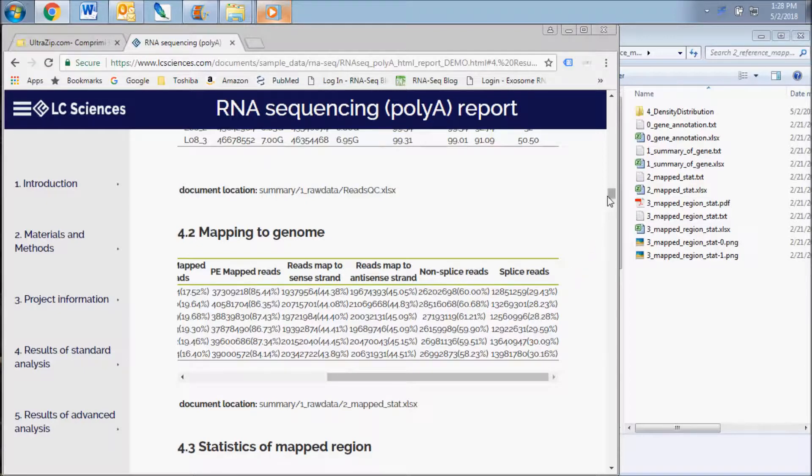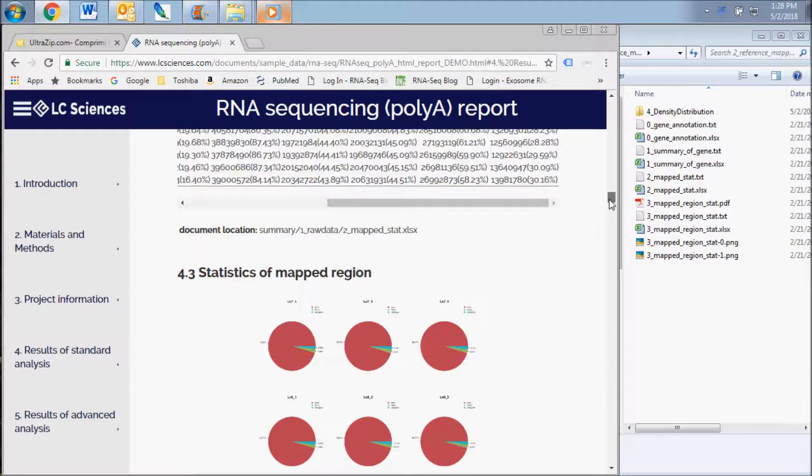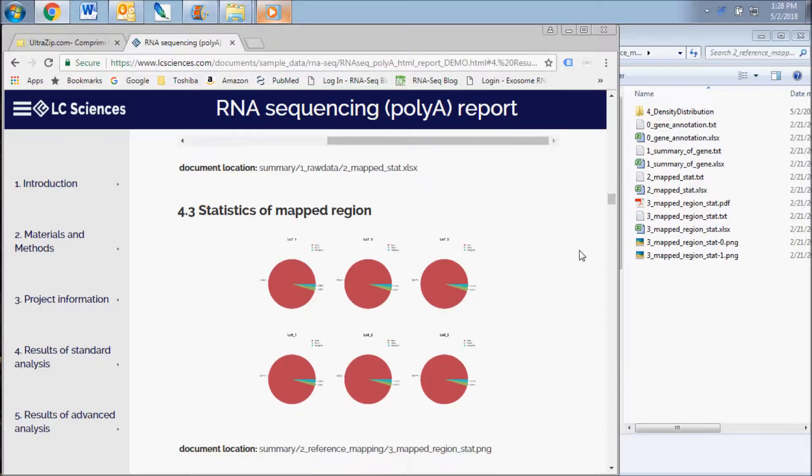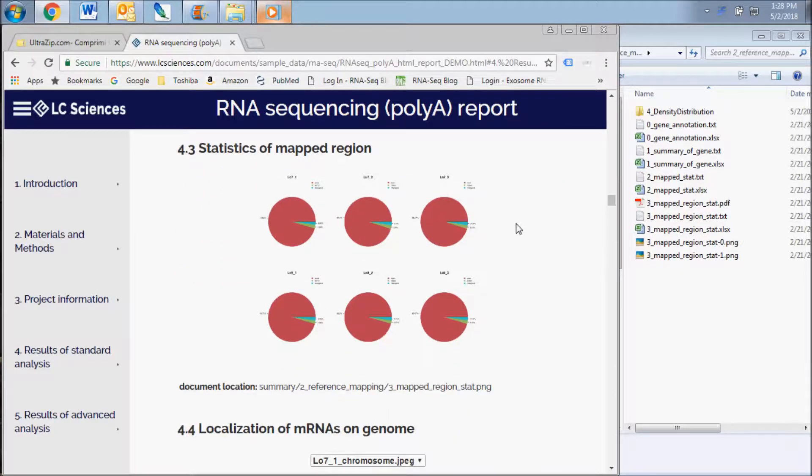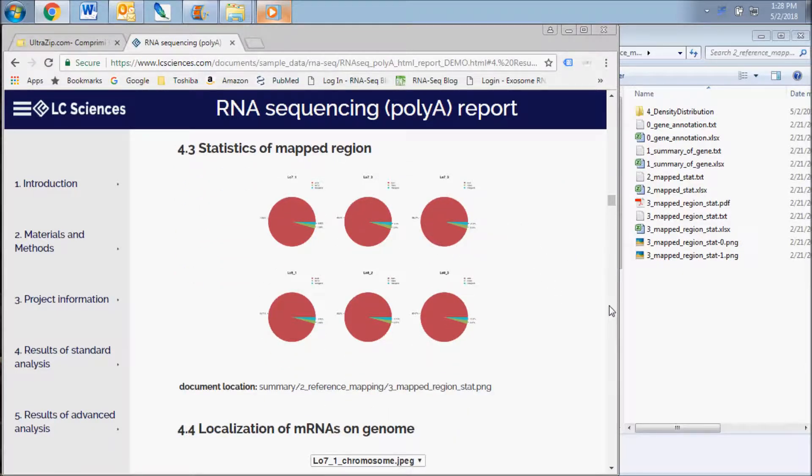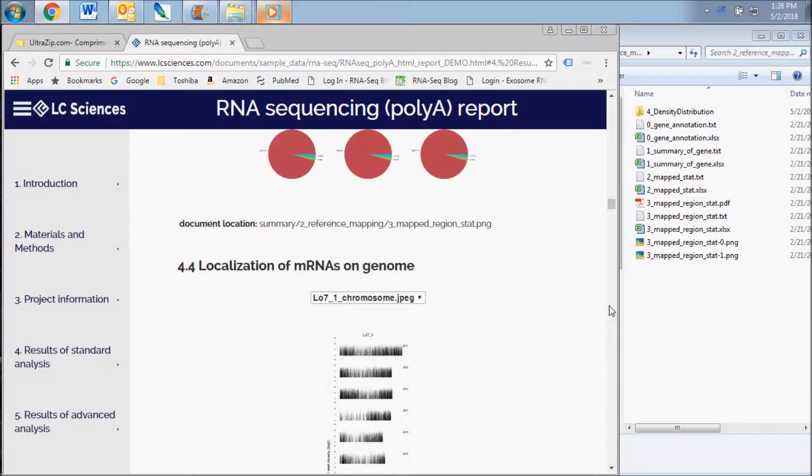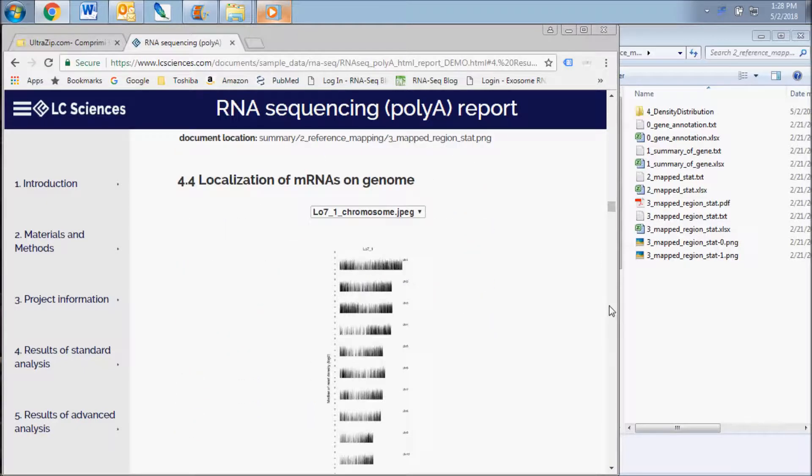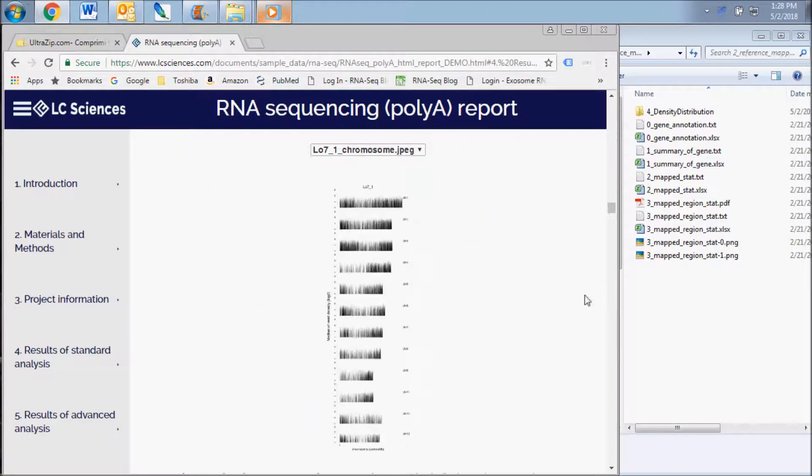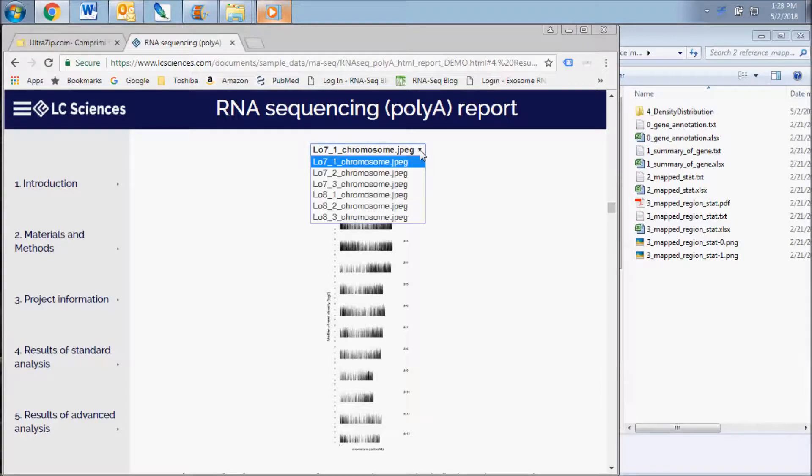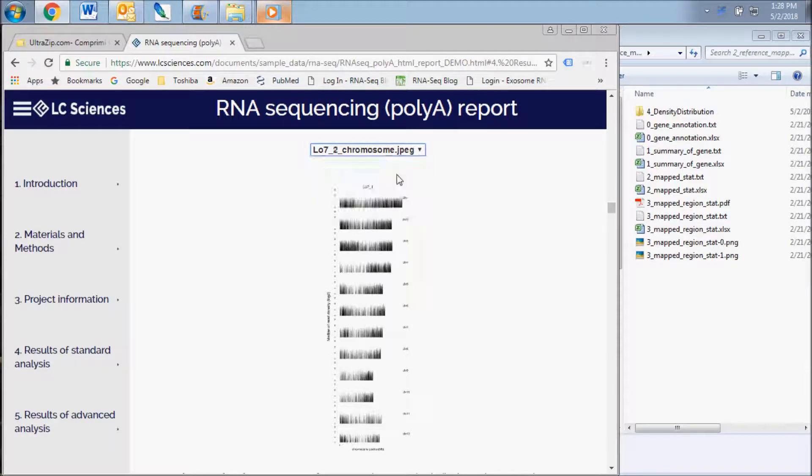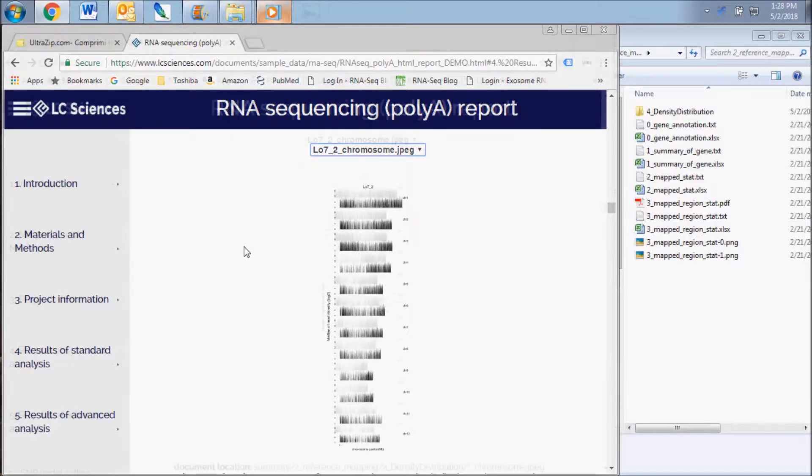The first chart displays the percentage of reads mapped to exons, introns, and intergenic regions of the genome for each sample. The next image visually displays the location of reads mapped in all chromosomes. You can use the drop-down box to select the chart for each sample.